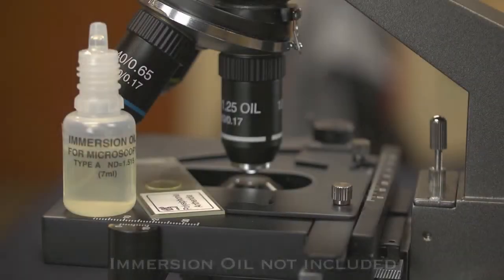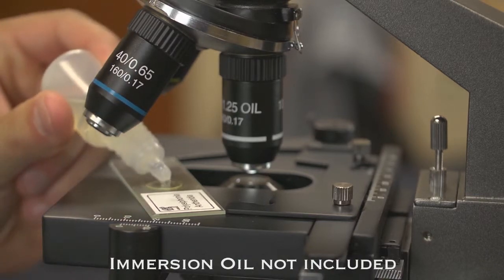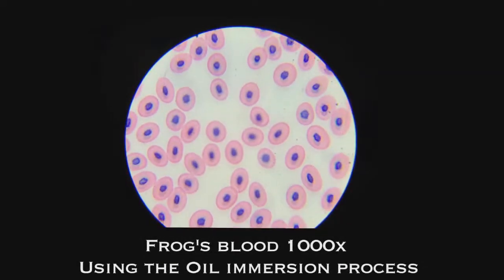When purchasing a 1000 power microscope, it's important to note that the oil immersion process is required to view an image at this magnification. This process requires adding a drop of immersion oil onto your slide before viewing your specimen. Once added, you will truly be able to see images at 1000 power.